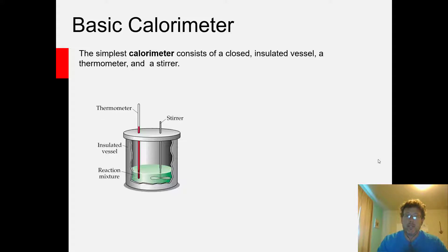The idea behind a calorimeter is you're building an insulated container which will trap any heat that's absorbed or released as part of the chemical reaction or the process that you're studying.